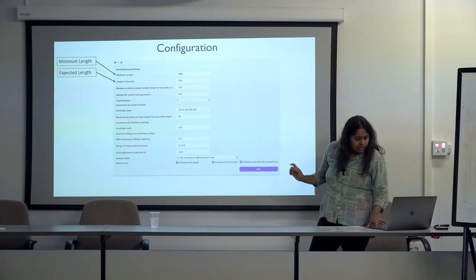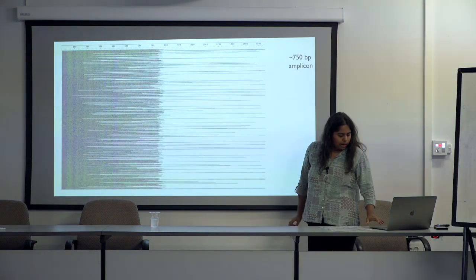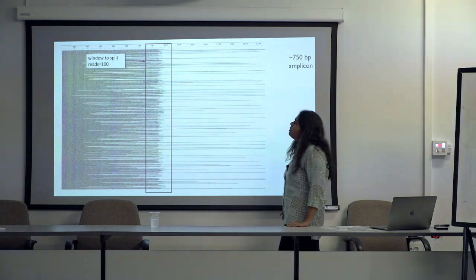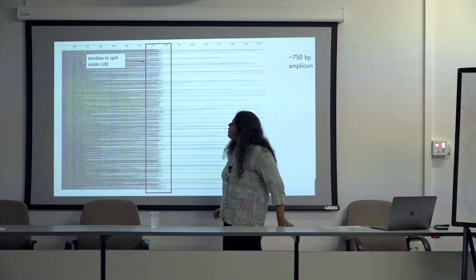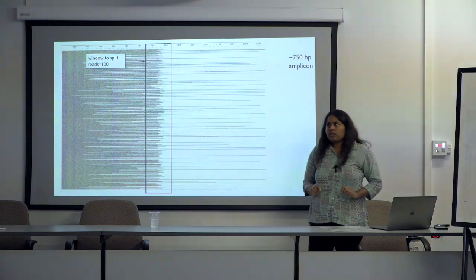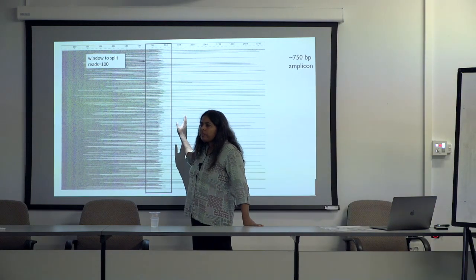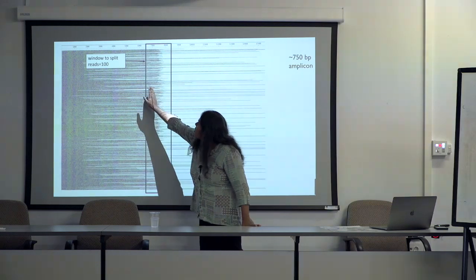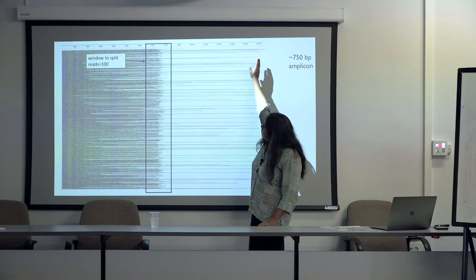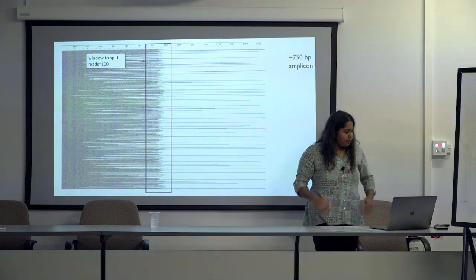The next thing is something that we observed routinely happens in library preparations when we are preparing MinION libraries, which is that if your cleanup after end prep is not good or your termination hasn't been good, products can self-ligate. So which is why you see these really clear profiles of two barcodes being ligated to each other.